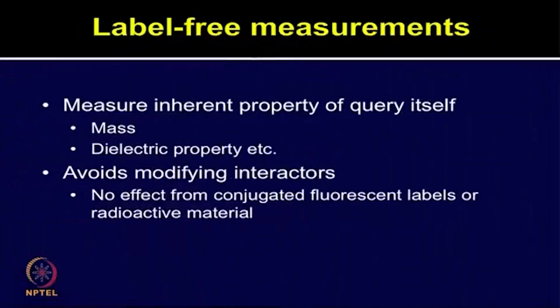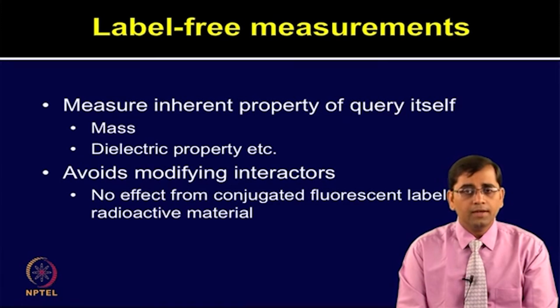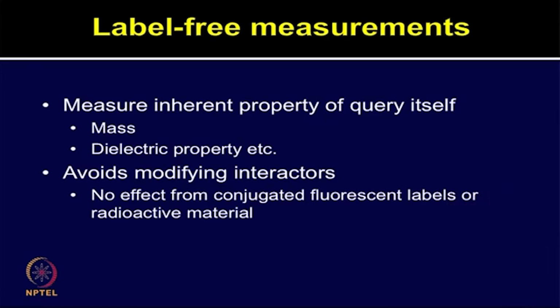Additionally, the label free approach avoids modification of interacting molecules. Since there is no label added separately, there is no interfering effect from conjugated fluorescent labels or radioactive material.